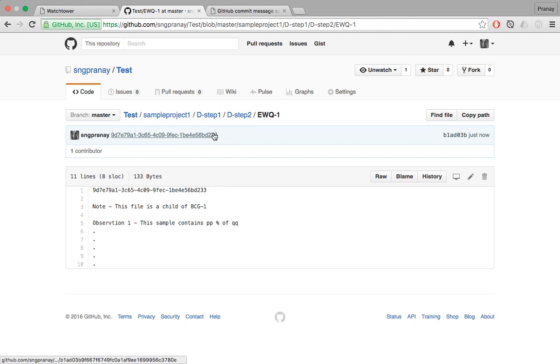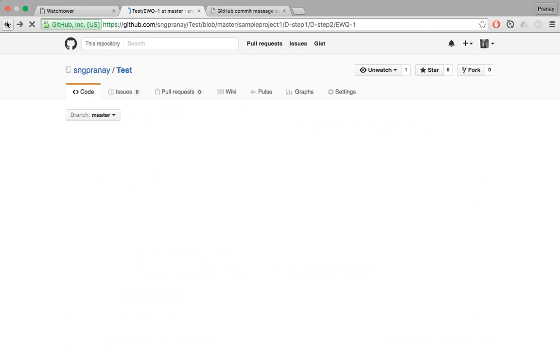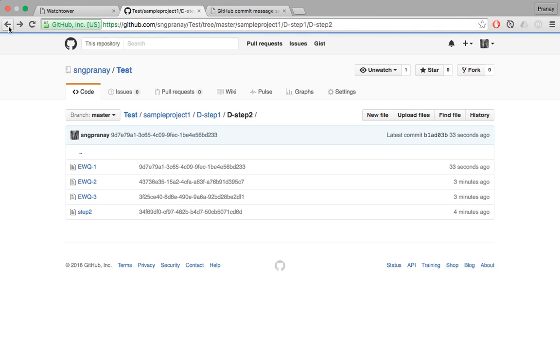Along with that, I also print out this commit ID and stick it on the test tube I was referencing this by, right? So now not only do I have a lab notebook functionality over here where I'm writing down the information that I need, I also have a way of referencing it to the test tube I'm using. Along with that, I also have a very neat progression of steps that I used for that project.